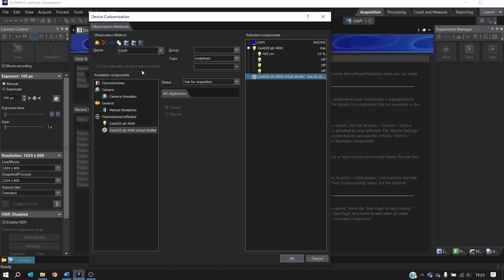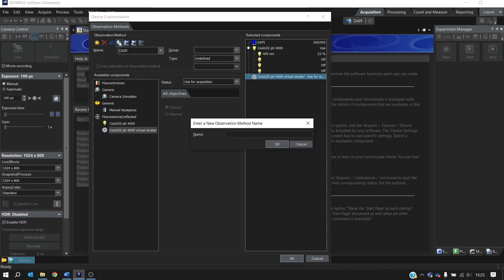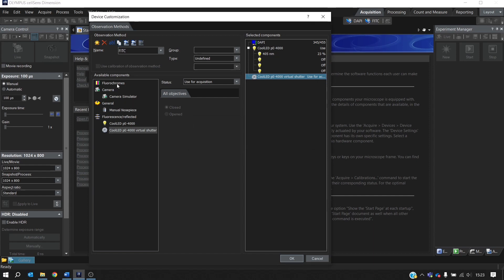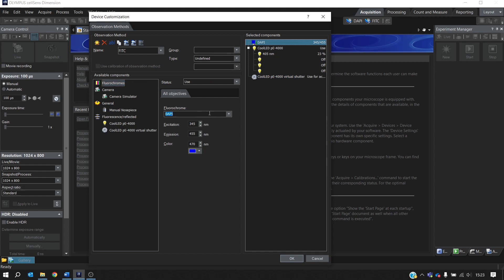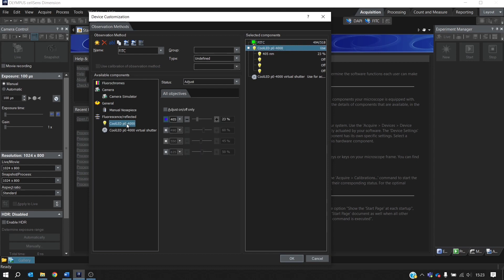We'll set up the second one now. And the easiest thing to do is simply to copy the observation method. And we'll call this FITC and press Enter. Now we just need to change the fluorochrome. And we'll type in FITC and press Enter. And again, it's automatically assigned here. And then we want to change the LED. So we'll change this to the second channel. 490 is already selected here. That's the correct LED. We'll just reduce the intensity slightly.